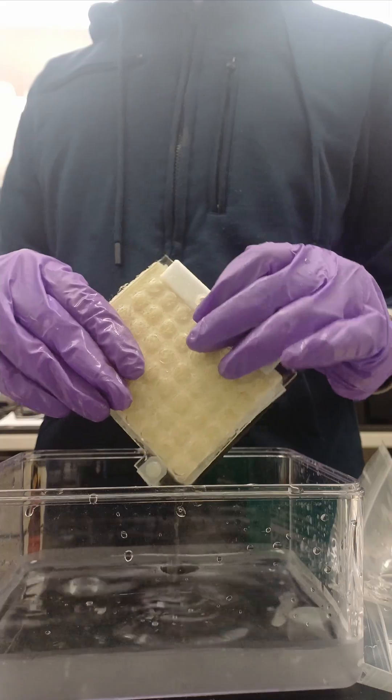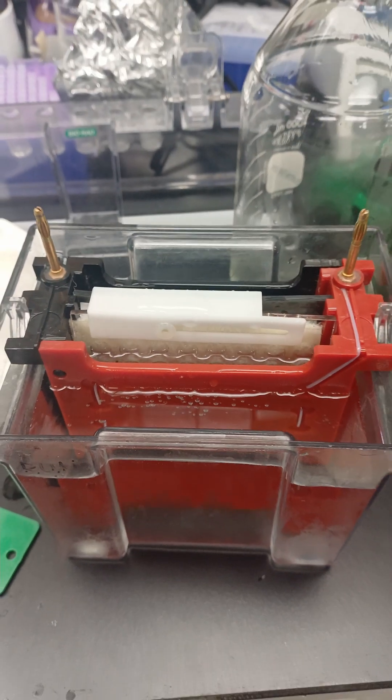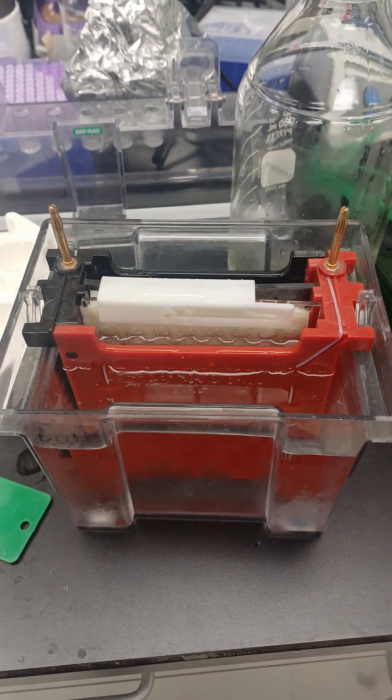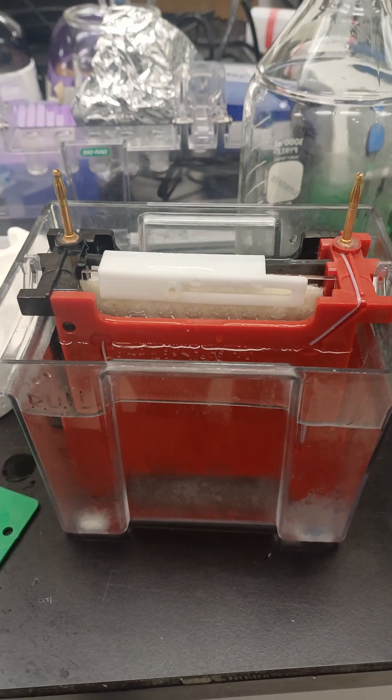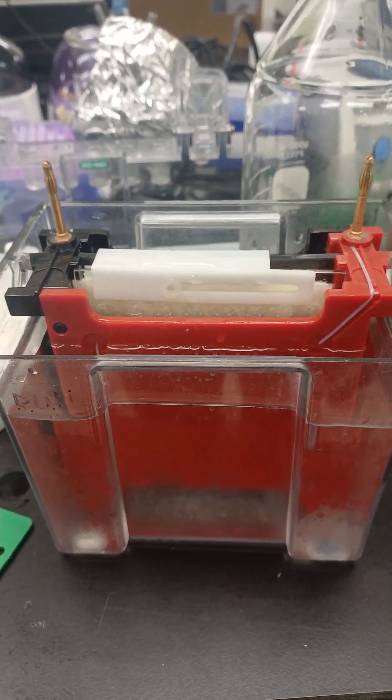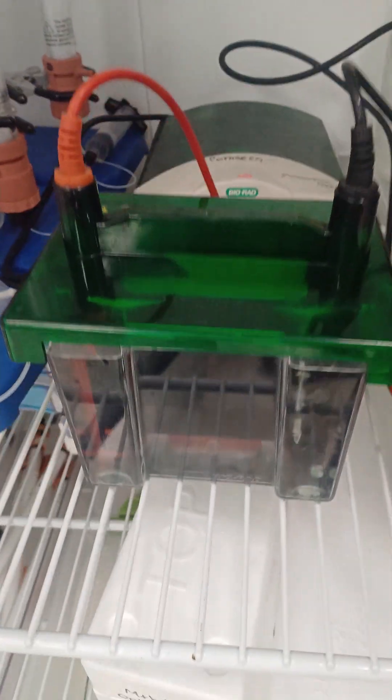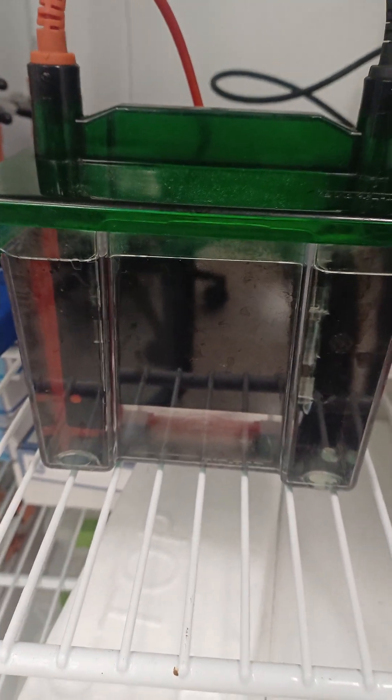Clamp the cassette and place it into an electrophoresis unit. Remember run towards red and since we want to transfer the protein from gel to the membrane, gel is on the black side and the membrane is on the red side. I am setting up an overnight transfer at 150 milliamps in the cold cabinet.